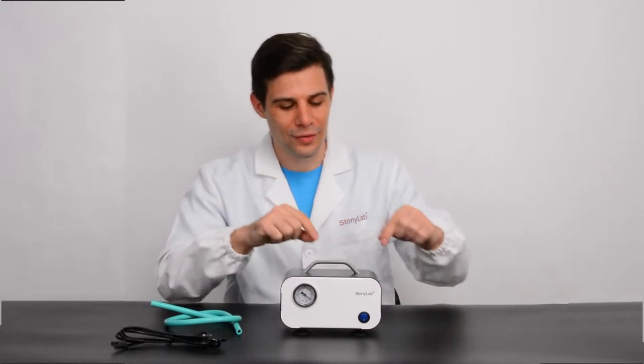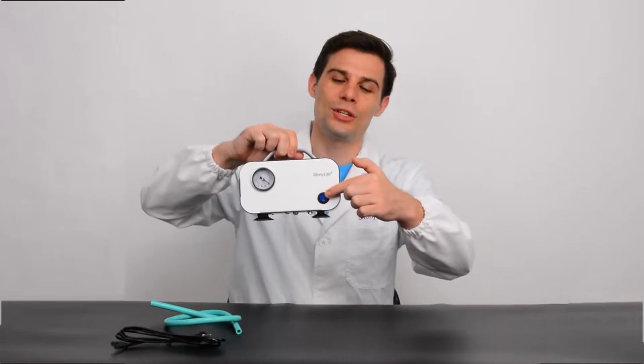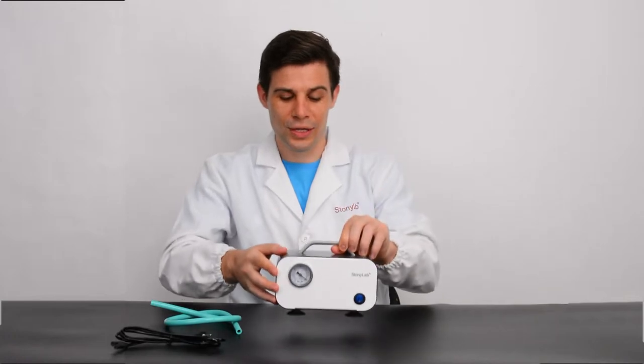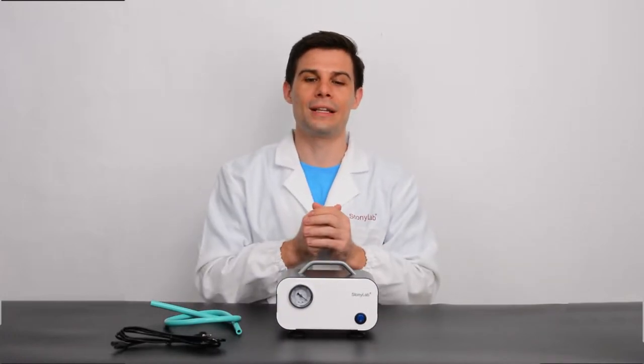You can see over here the LED switch and over there you can see a high-precision vacuum gauge. What is really cool about this vacuum pump is that it is equipped with overloading, overheating and short-circuit protection.